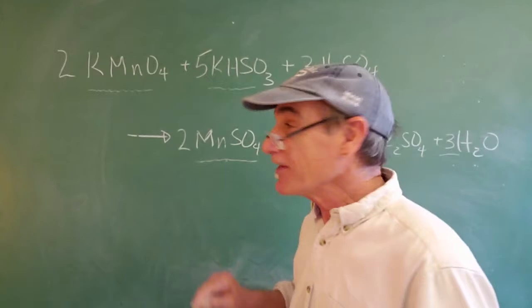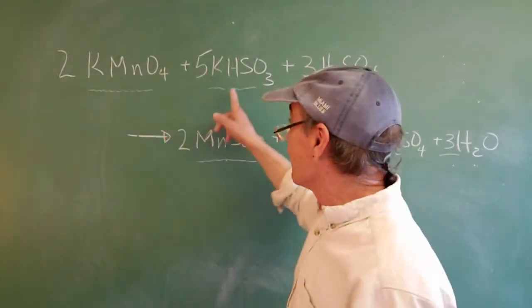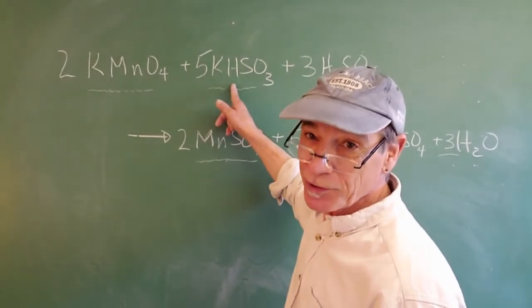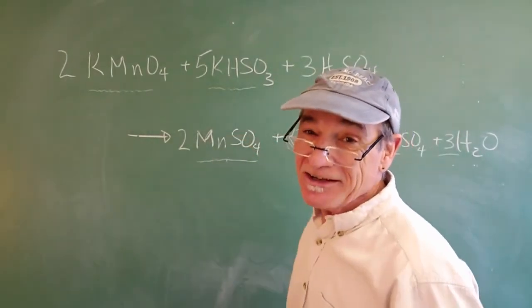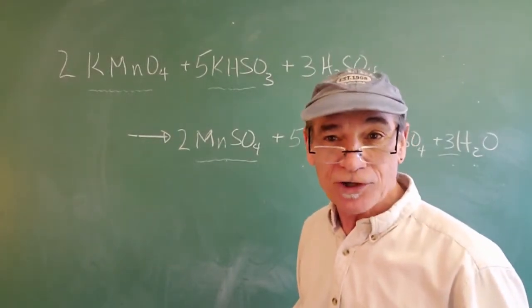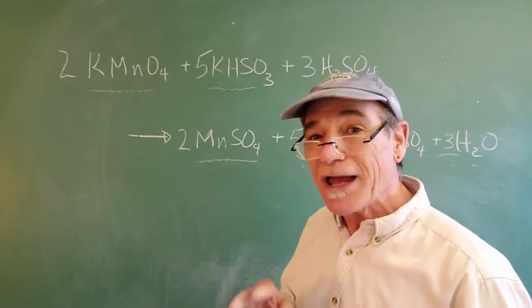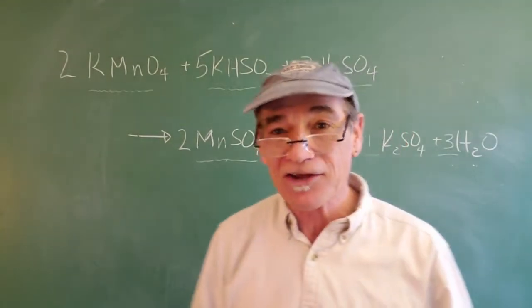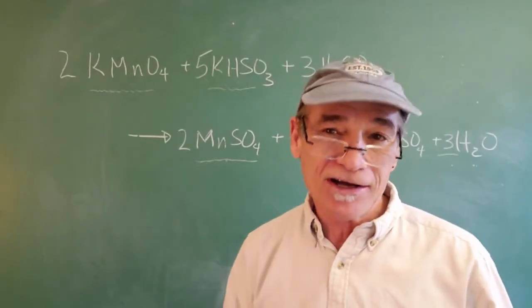And we can figure out how strong the permanganate solution was by knowing how strong our titrant was that we dribbled in there. Just like an acid-base titration, only in this case, it was an oxidation reduction titration. Well, let me get rid of this and I'll elaborate a little bit about normality. If you remember, we used that in our acid-base titration days. We're going to apply that same concept here to oxidation reductions.